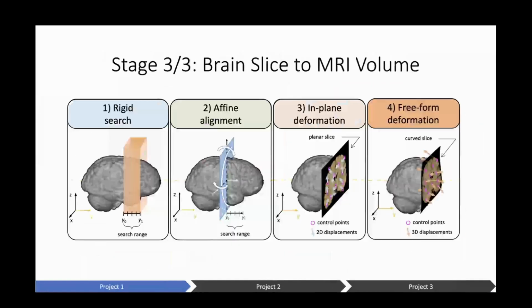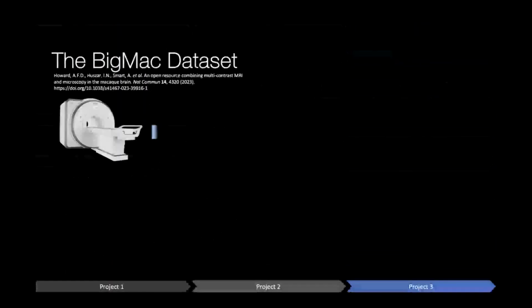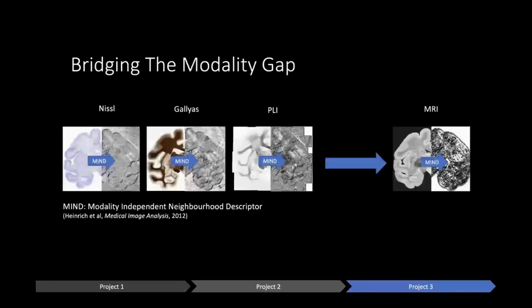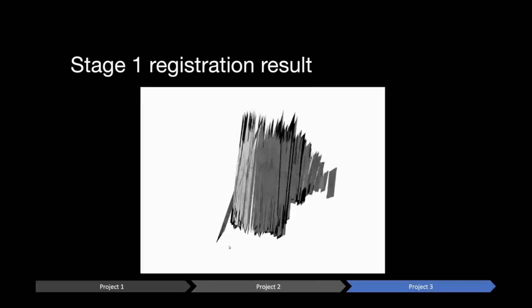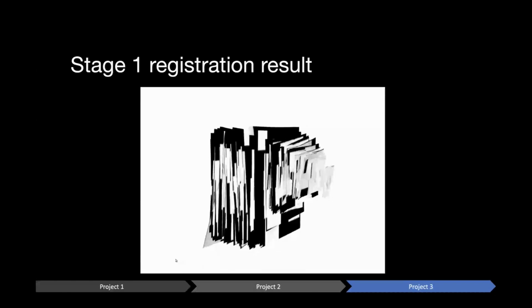And in terms of the slices, when we have multiple slices densely sampled from the monkey brain, there's no explicit regularization of the deformations there, apart from the fact that we always use bounded optimization. So when we introduce these deformations, which are deforming the slices out of plane, we always limit them to not exceed a certain number of millimeters, and that's usually 3 millimeters. That's one way of implicitly achieving this regularization.